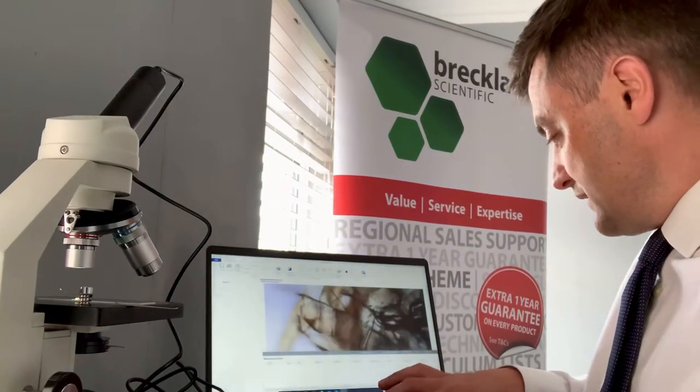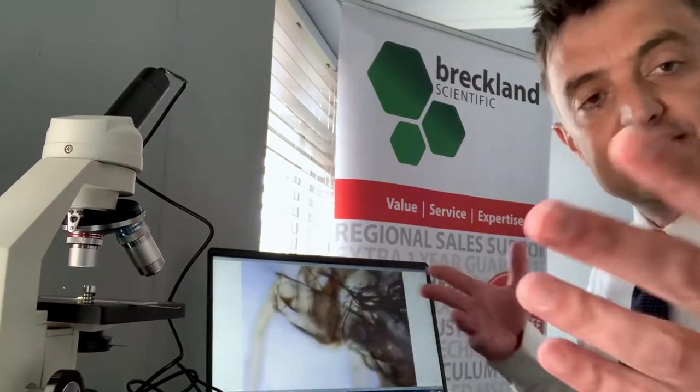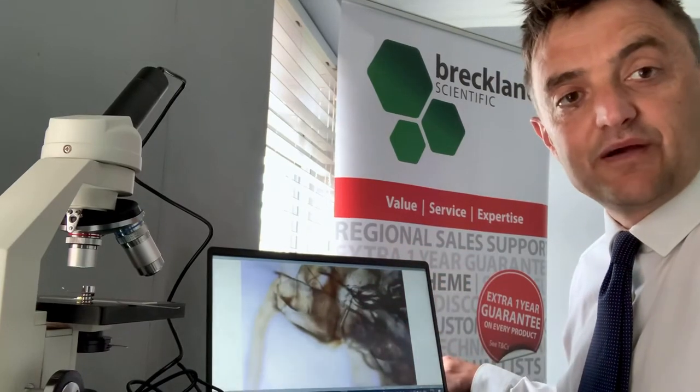Let's zoom - let's make that full screen actually. There we go. So hopefully, behind the flicker that you'll obviously get with two cameras, you'll be able to see a nice image there with lots of activity going on.